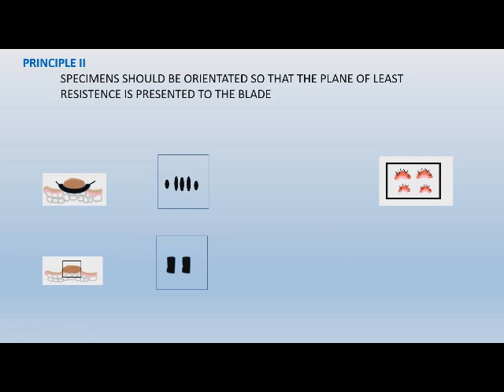So let's say if we use this as our embedding technique, then it's highly possible that we might come up through the bottom layer, nick our blade, and as it goes to the top layer, we might damage the tissue. We might actually striate it some with the nicks on our blade. So we could say, well, we can stop that by just putting them side by side.